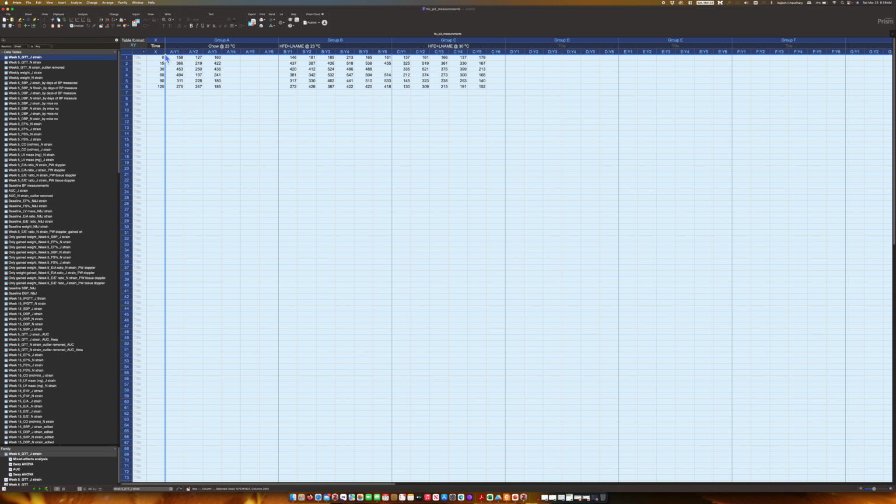So as you can see here, I have the 3 different groups, and these are the glucose tolerance test values for each individual time point, starting from 0 to 120 minutes. We have provided them with 2 gram per kg body weight of glucose, which is a standard, and then we have measured at every point, like at the baseline and the 15-minute post, providing them the glucose.